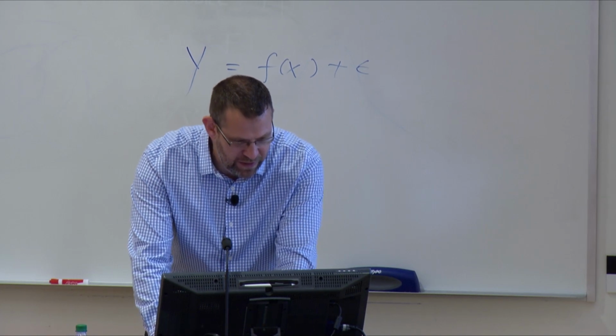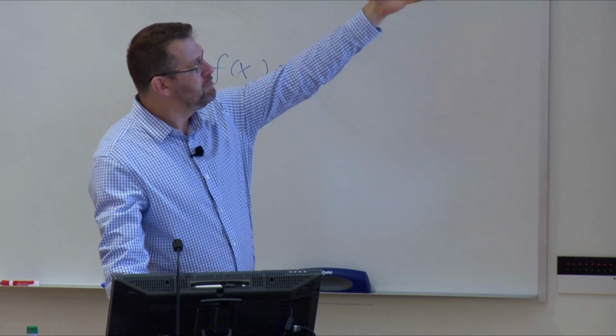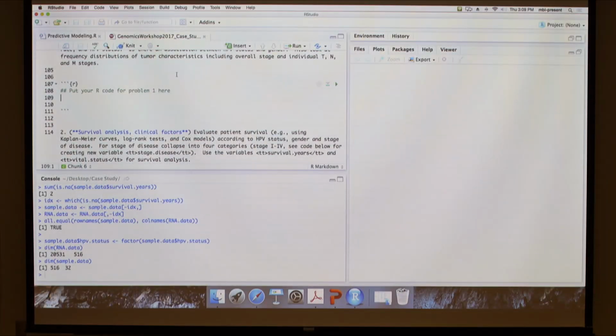And of course, in the case study markdown file, I put your code right there. So that's what you guys should do, is enter in your code for doing the first problem. It's not really a homework, but we'll go first problem right there.